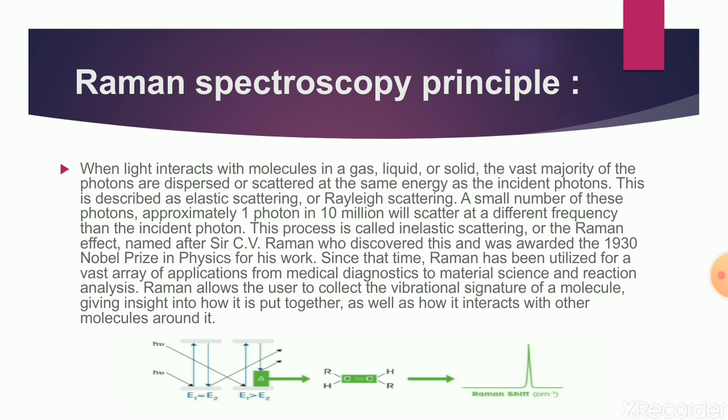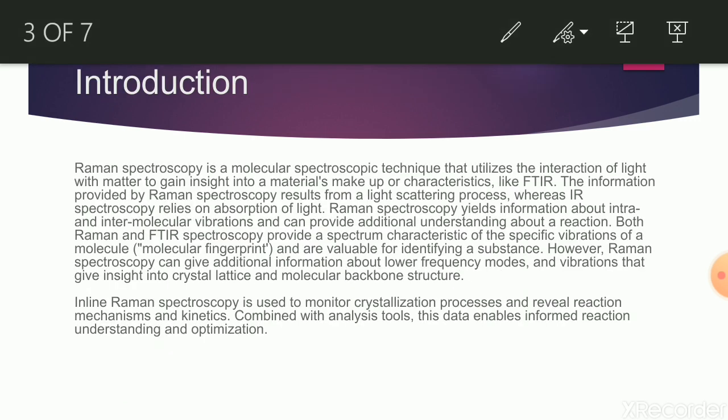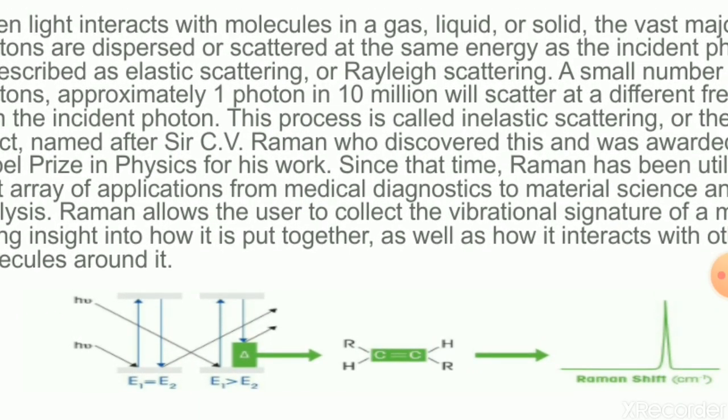The spectrum is obtained with laser light. Hence, the peaks are measured as the shift from the laser light. The peak positions are determined by the vibrational energies associated with the bonds in the molecule of which the sample is composed. Because of this, the spectrum ends up looking similar to an IR spectrum and is interpreted similarly.